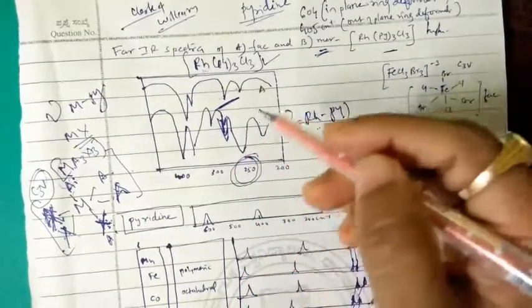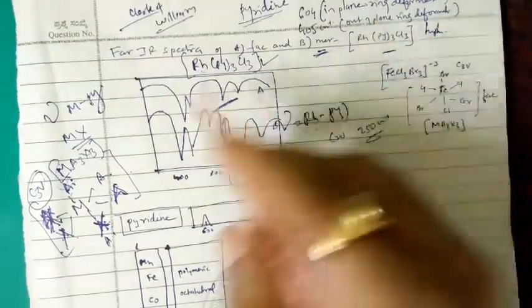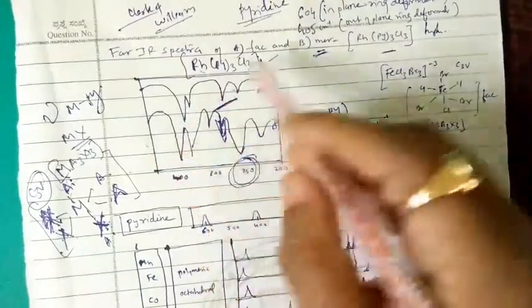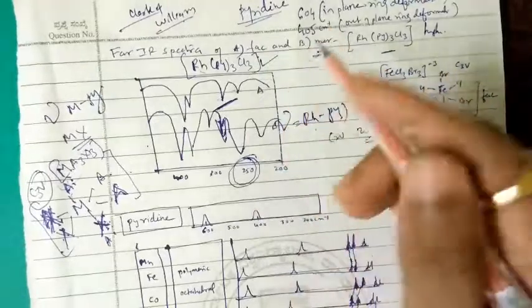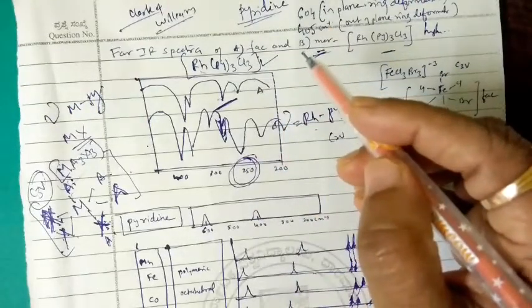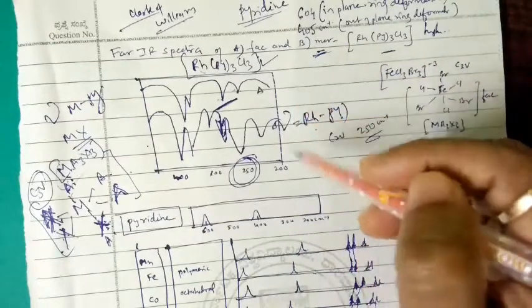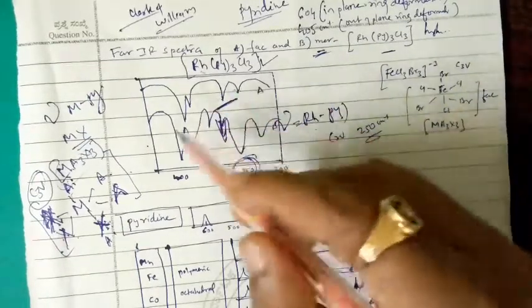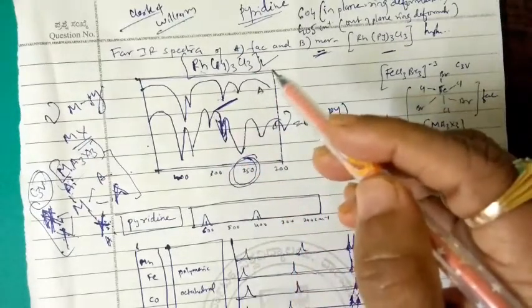So this is how, if isomeric structures are present, we can distinguish them with the help of IR, with respect to the frequencies, in such complexes whenever the pyridine is complexed with the metal ion. Both the metal ion as well as the halide ion are very much important.